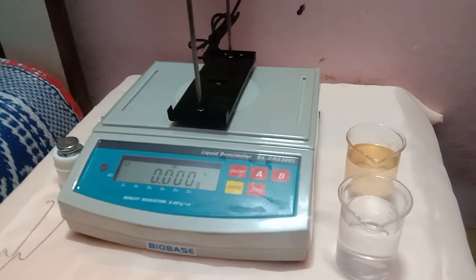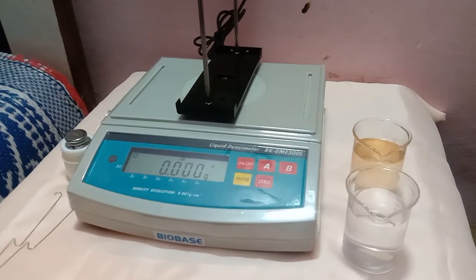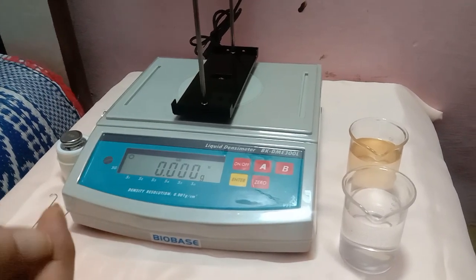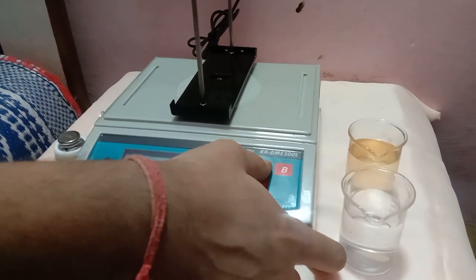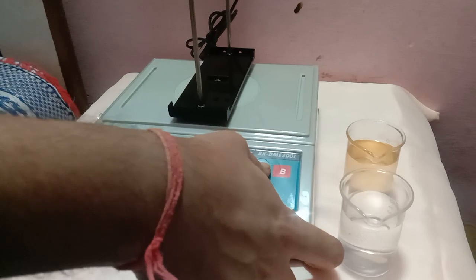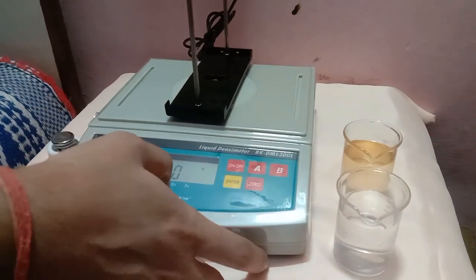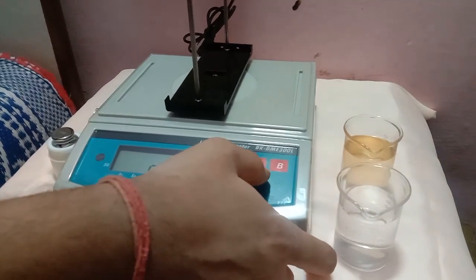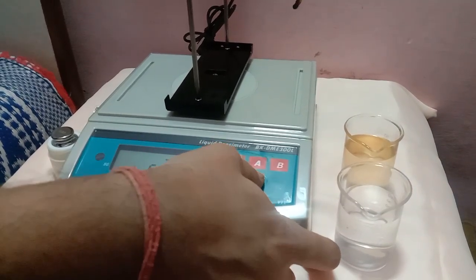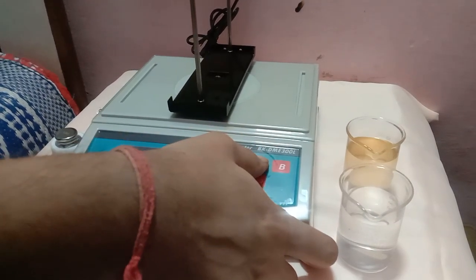Let's do the temperature compensation. Take the temperature value of the water — I have already taken it, it's 30 degrees centigrade. Long press the A button to feed the value. It's already at 30 degrees. You can use the 0 button to move the cursor and the A button to enter the value.